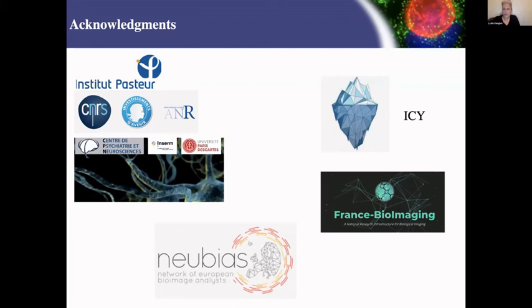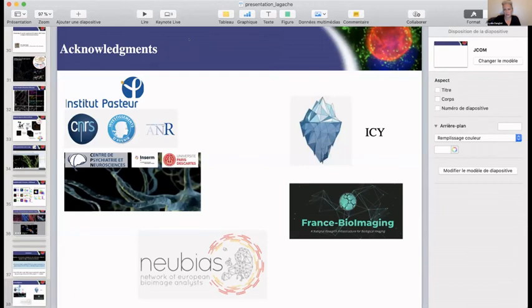Yes, so we have some questions. Some of them have been answered online, but the first question was, can you have a specific file format, and can you use whatever CSV file to load your localization? No, there is no format.